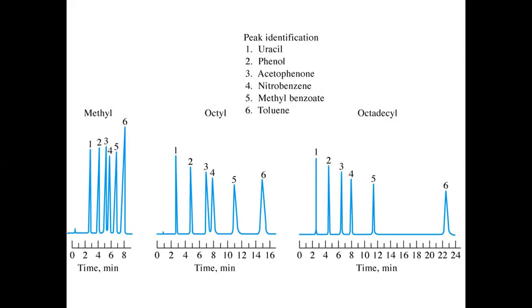and therefore the separation process is not going to be successful. If you change the methyl silane to octyl silane as the stationary phase for the separation process, you are able to complete the separation within 16 minutes, because the sixth compound has been eluted in 15 minutes. So 16 minutes will be the maximum time. The overlapping which was seen in the separation of these six compounds while using methyl silane as the stationary phase was diminished while using octyl silane.